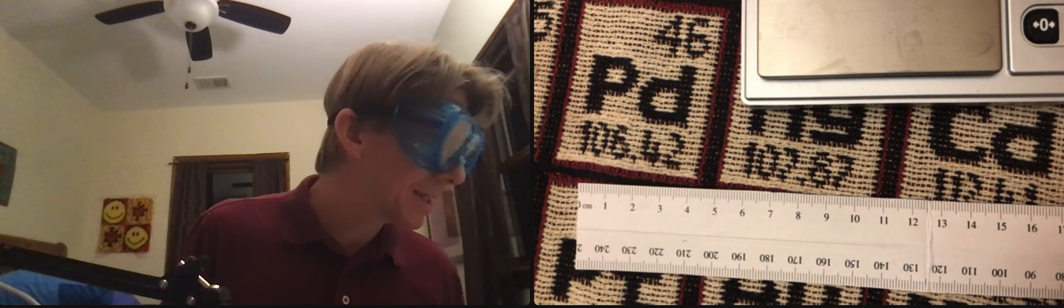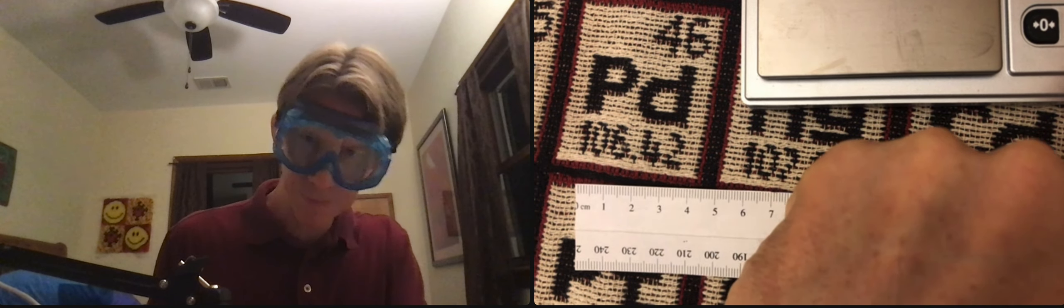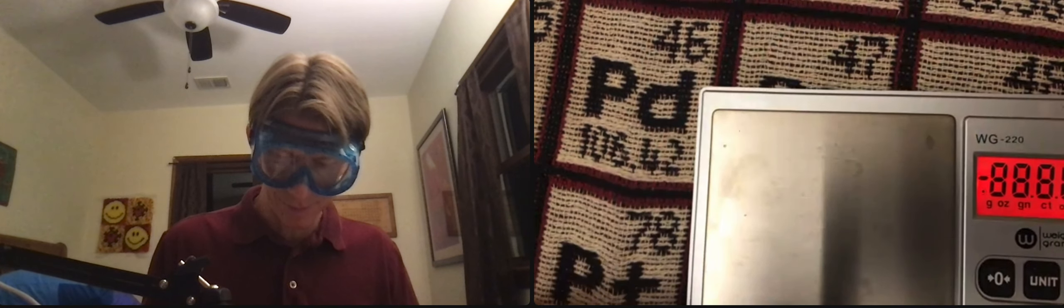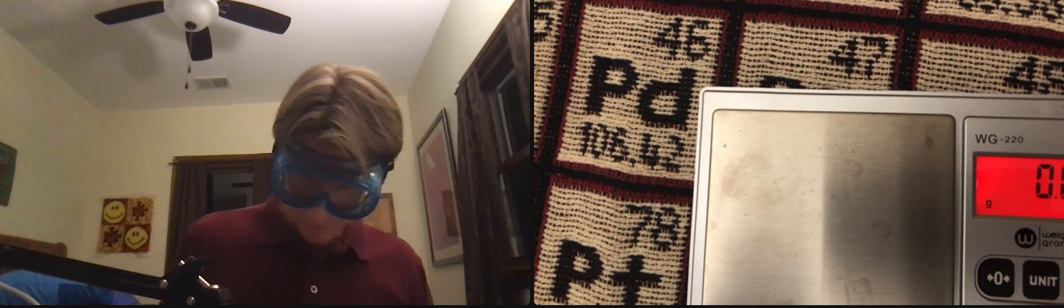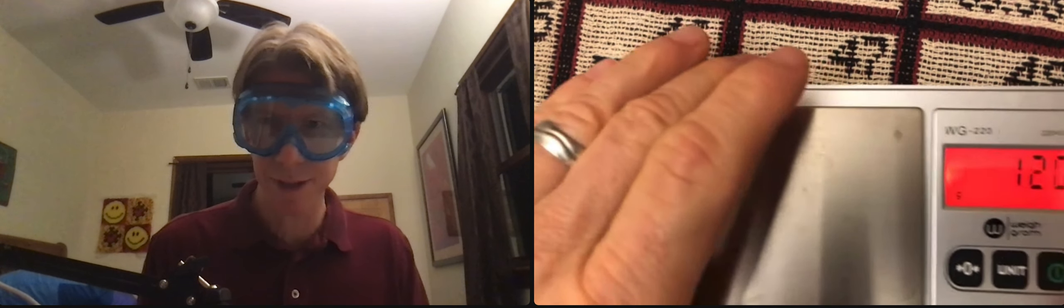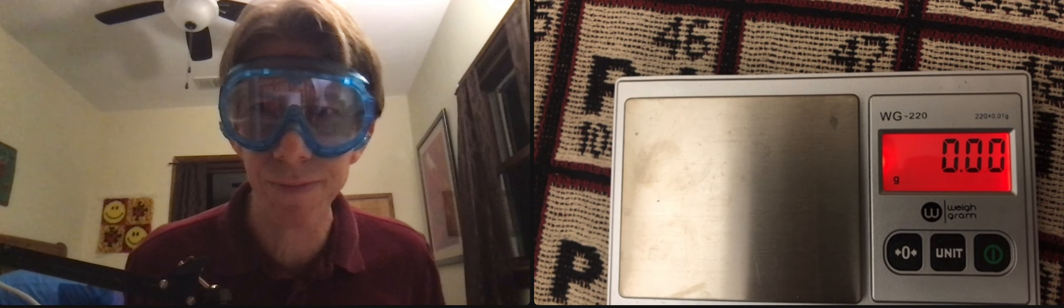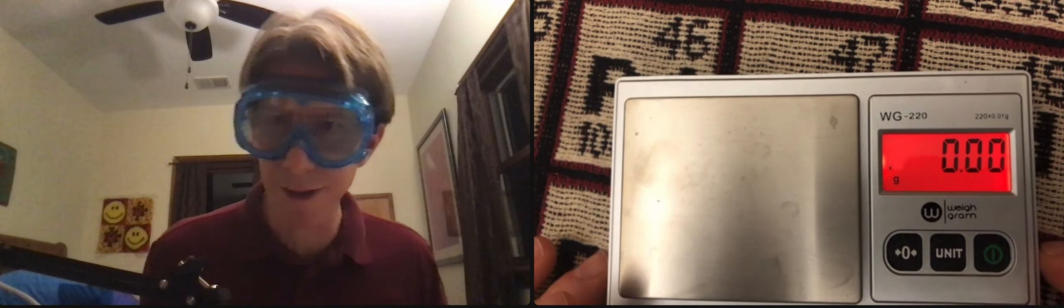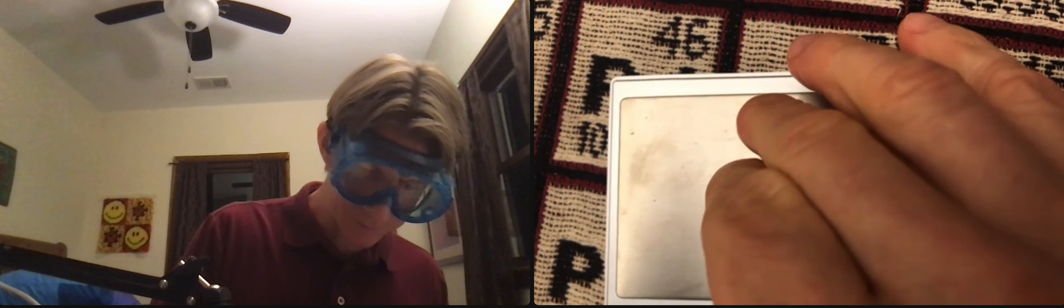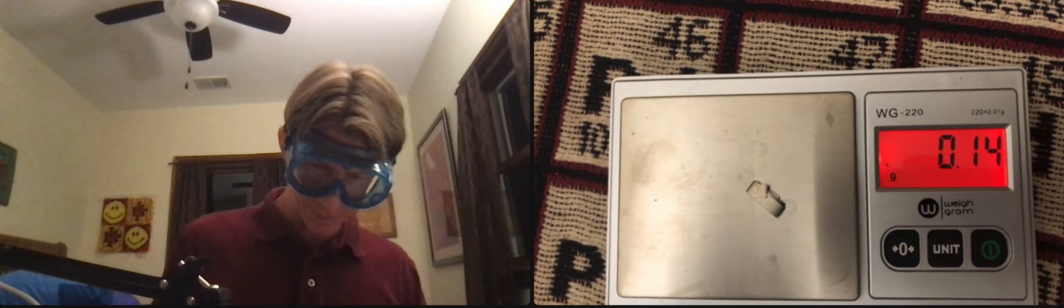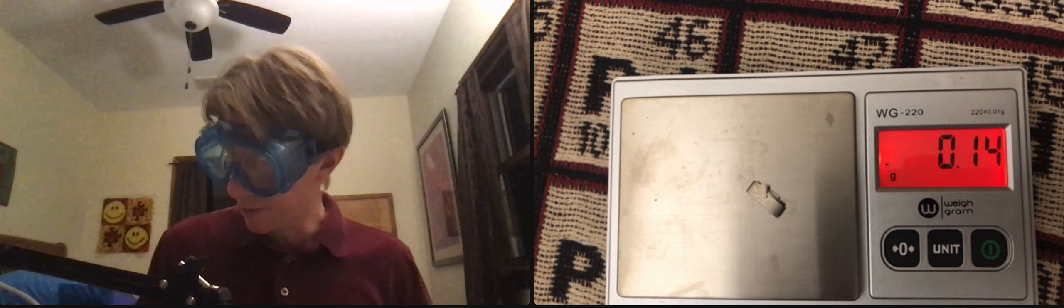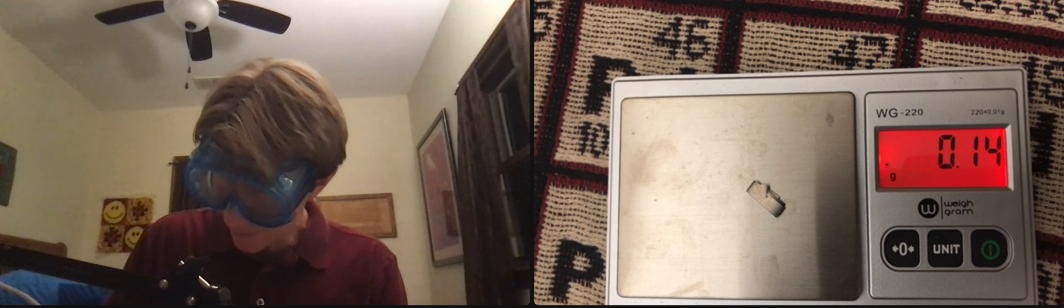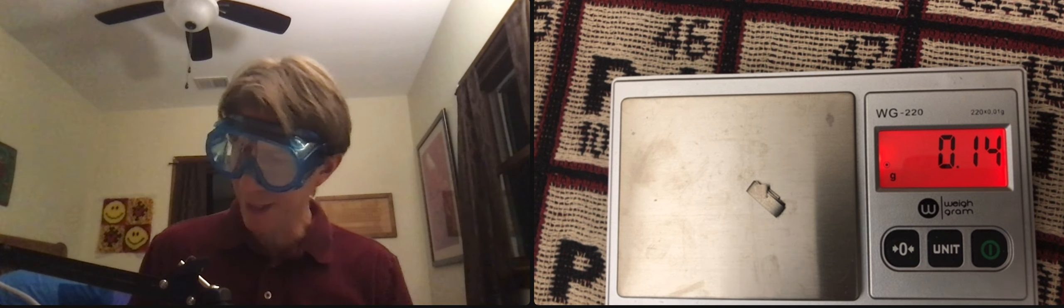And next, record the mass of the magnesium ribbon. Wait for the dot to appear. Can you see the dot? The dot is not there. The dot is there. Yeah, there it is. All right. And I get 0.14 grams. So I've written that down.